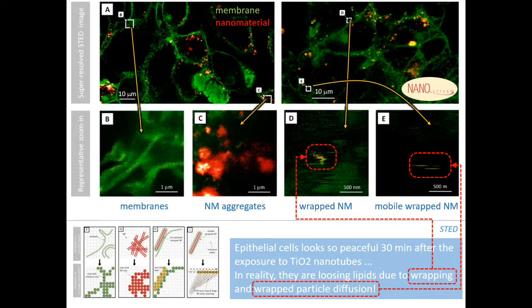If I start at the very beginning, we started with exposure to a mimic of lung epithelium, which is a living LA4 barrier.